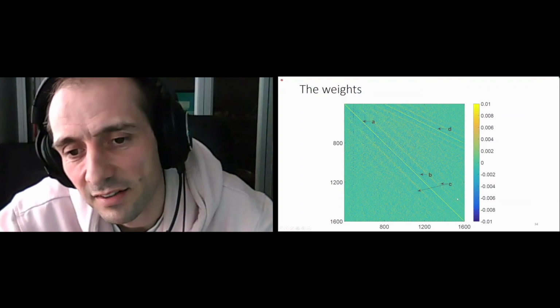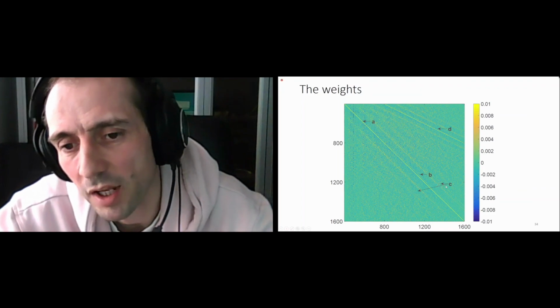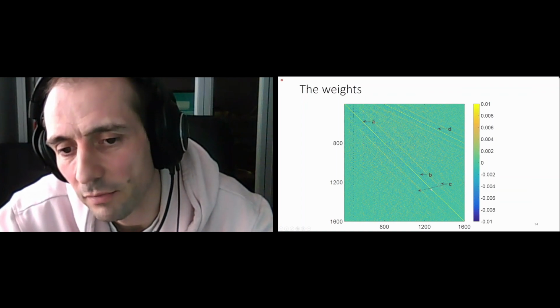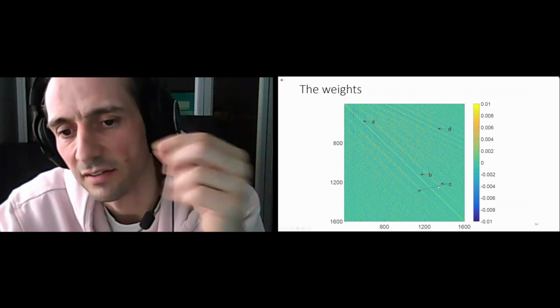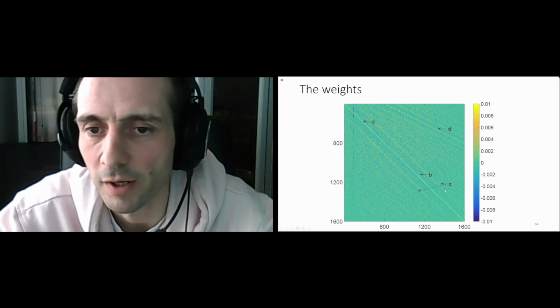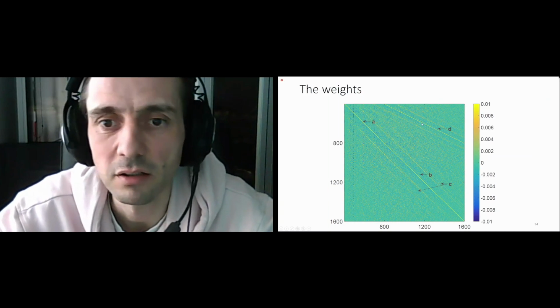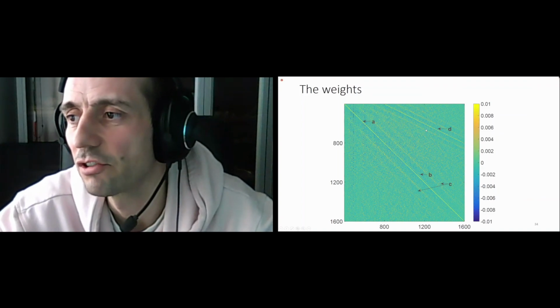And these are the peaks which are one amino acid far away from the middle position. So here we have one amino acid, and then these are the subsequent and the neighboring amino acids. And then we have this skewed diagonal, and these correspond to double charged peaks.